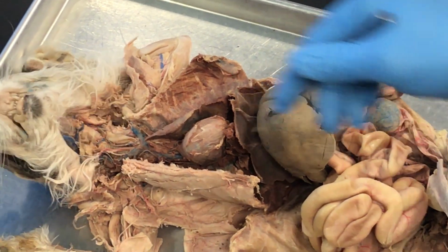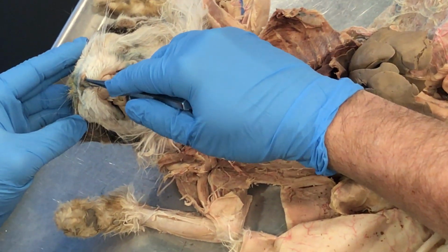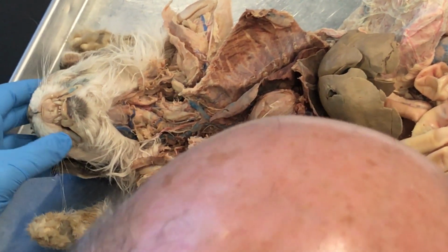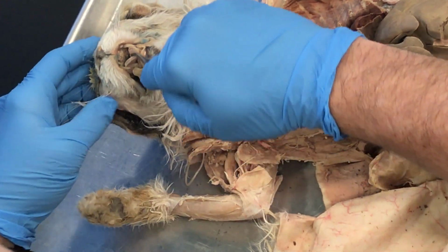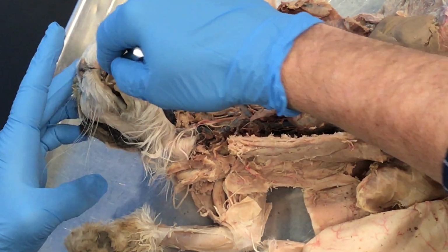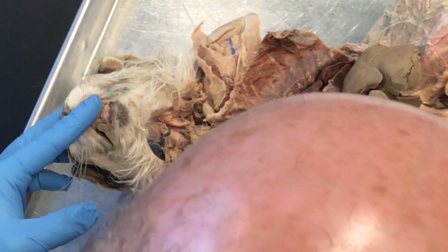So external nares, was this the cat I did before? Maybe it was. So external nares are the nostrils. You can see them right there. Oral cavity, you open the mouth, you can see that there's the oral cavity. That's about as far as we're going to get. We're not going to cut stuff open to see stuff further back, but that's oral cavity.